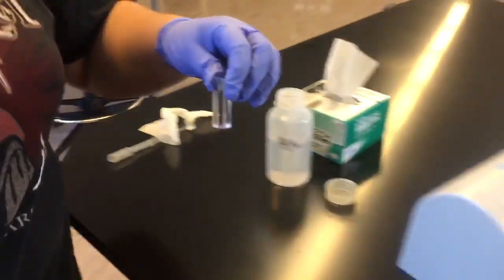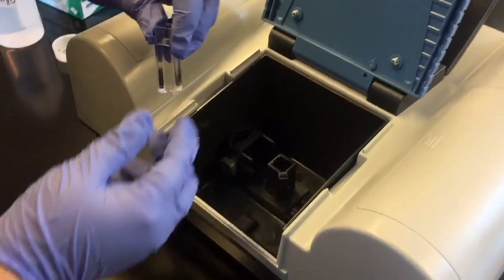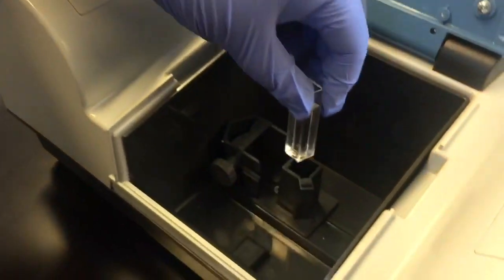Next, you're going to go to your UV spectrometer, lift the lid, and place your cuvette with the arrow pointing to the left.